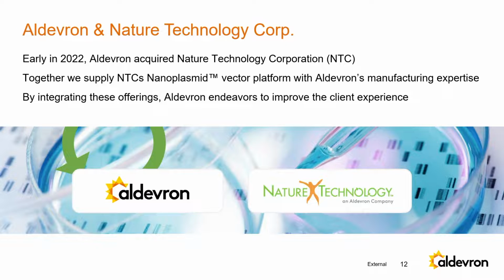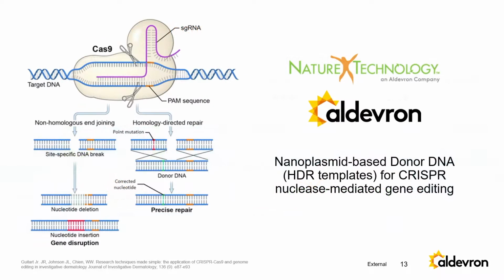So I'm going to talk about the nanoplasmid platform, and give you a background of what it is. Some of you aren't working on CRISPR, but it has benefits to a wide variety of vector types. I'll go over that briefly, and at the end, I'll talk a bit about the use of nanoplasmids as donor HDR templates for knock-ins.